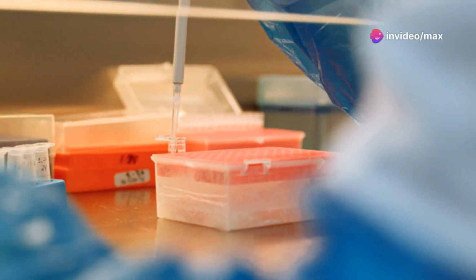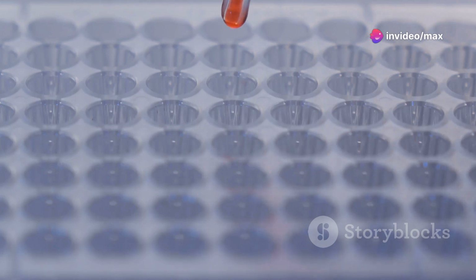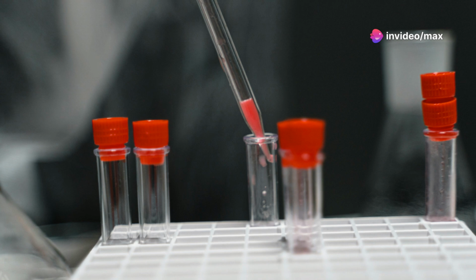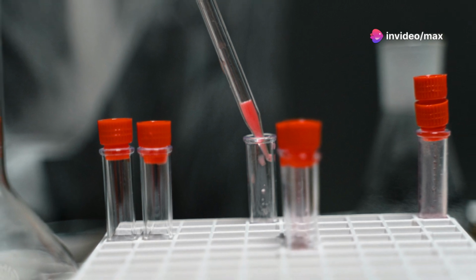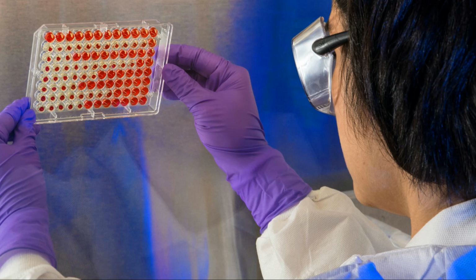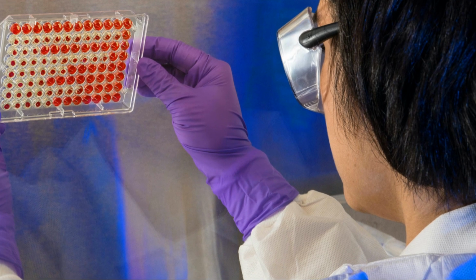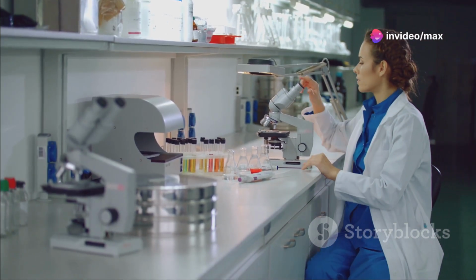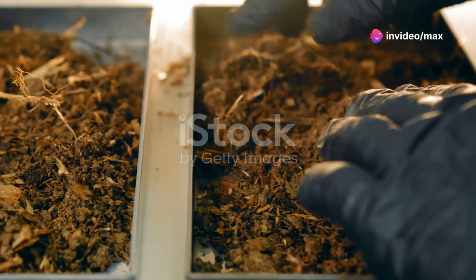Then comes the plate, a special plate with multiple wells. Each well acts like a tiny test tube where the ELISA reaction takes place. We also need a washing solution to remove any unbound molecules and prevent false positive results. Finally, we need our enzyme-linked substrate duo, the color-changing artists of our experiment. The substrate should be chosen carefully to provide a clear and easily measurable signal. With these essential ingredients in hand, we're ready to embark on our ELISA journey. Let's move on to the step-by-step process of this incredible technique.